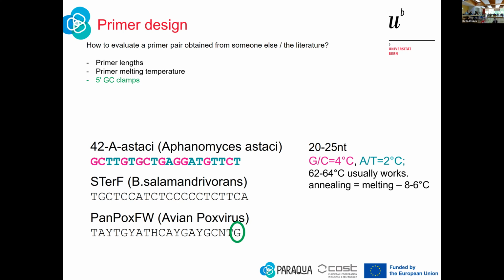And it's sometimes not possible for specificity reasons, but if you can, try to design them. Sometimes you can just move the primer one nucleotide to one direction and order it again. For example, this could, without this A, but maybe have another base here, then you would have.